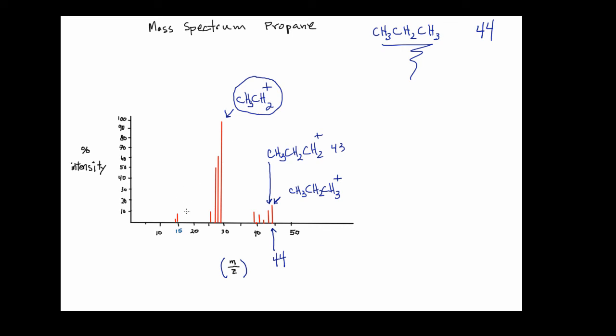I should say. And then I want to call your attention to this one down here, because basically what this thing lost is equivalent to this here. So this particle that's at 15 for molar mass is equivalent to 1 carbon and 3 hydrogens, which is essentially what this thing lost here, right? The molar mass of this is 29.